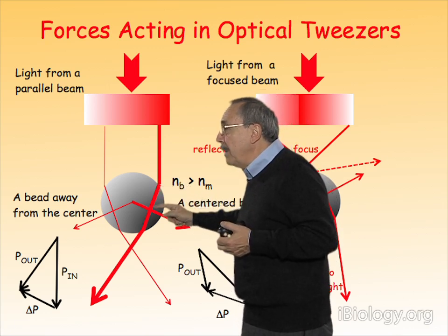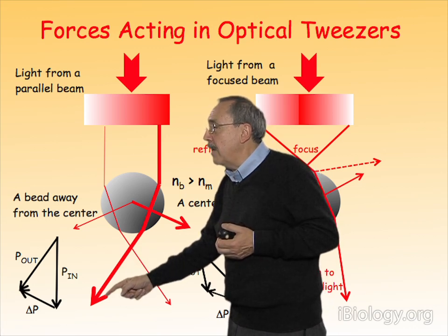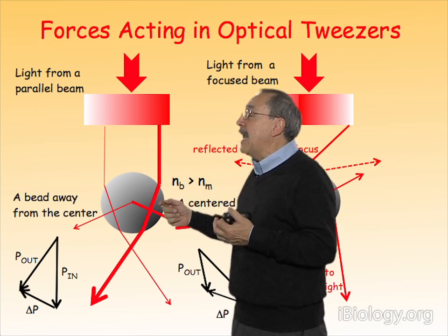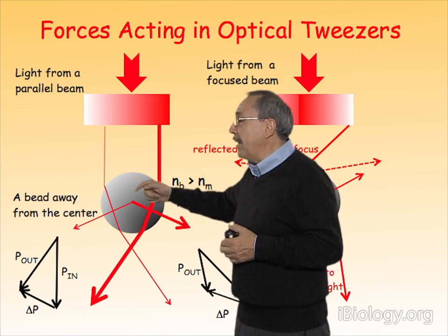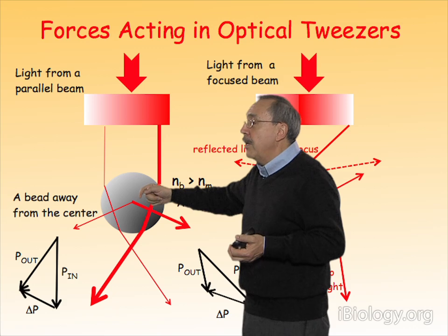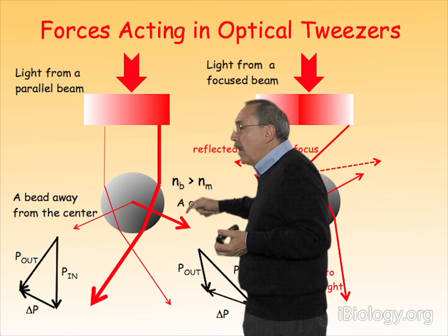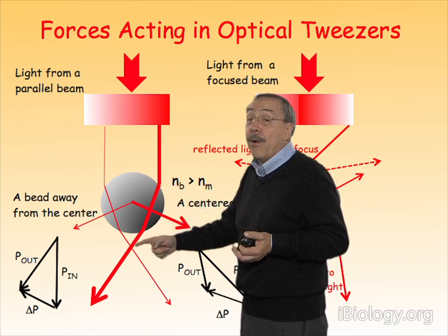And these photons will be refracted, and we will have a more or less symmetric situation in which these photons also have lost momentum downward and have gained momentum rightward, right? So now the bead is going to gain, in order to compensate for that loss of momentum, momentum downward, and also towards the left, in order to compensate for the momentum gained by these photons towards the right.